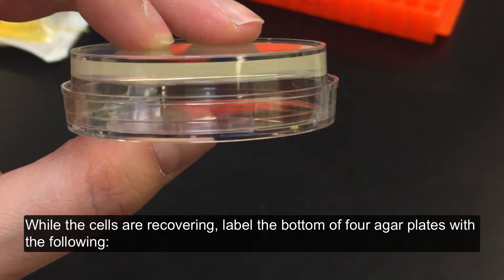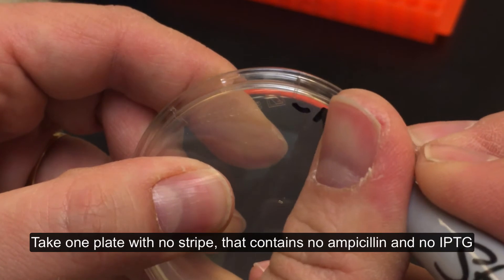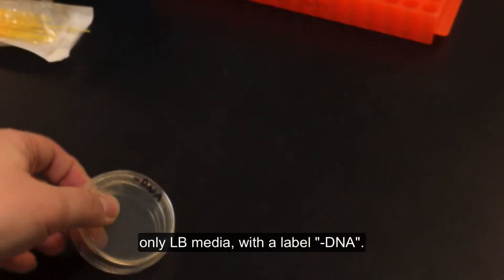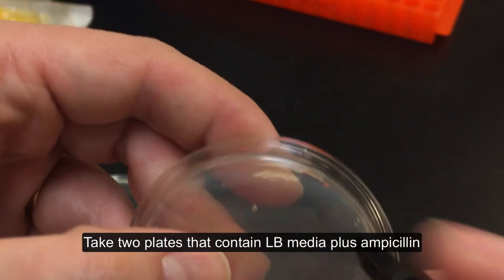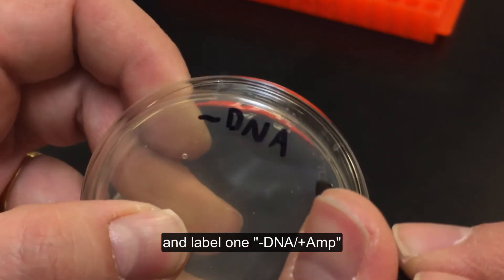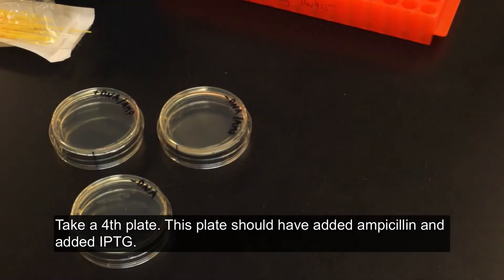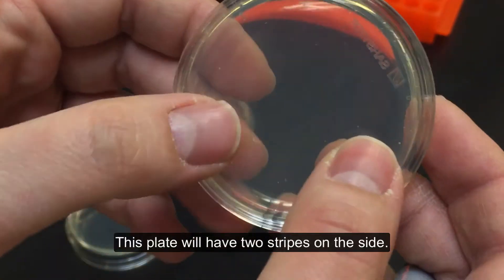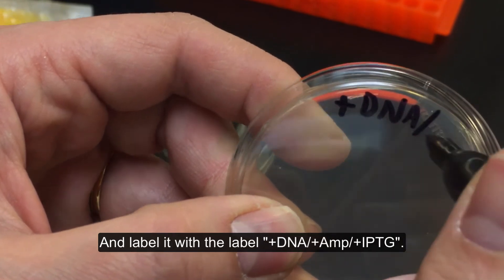Incubate the cells for 10 minutes in a 37 degrees Celsius heating block. While the cells are recovering, label the bottom of 4 agar plates with the following. Take one plate with no stripe that contains no ampicillin and no IPTG, only LB media, with the label minus DNA. Take two plates that contain LB media plus ampicillin and label one minus DNA plus ampicillin. Label the other plus DNA plus ampicillin. Take a fourth plate — this plate should have added ampicillin and added IPTG, and this plate will have two stripes on the side — and label it plus DNA plus ampicillin plus IPTG.